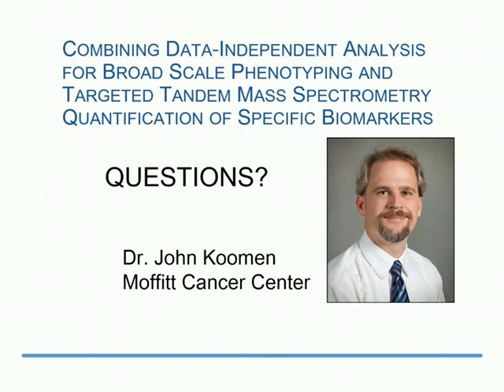Okay, next up, can you analyze interprotein cross-linking by DIA? I would think that you would be able to, but I don't know. We've obviously not tried that.